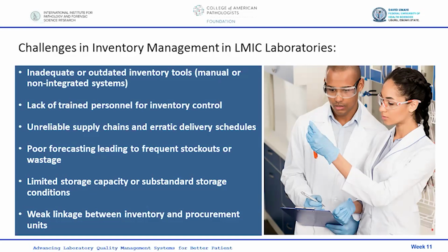The tracking is from the donor to the patient. You see everything, the stock, the expired ones, the ones that have issues, how they discarded them, the outcome of the screening of the donated blood and all of that. It's just a seamless thing that you could view in real time.